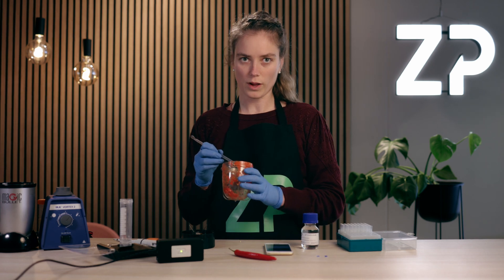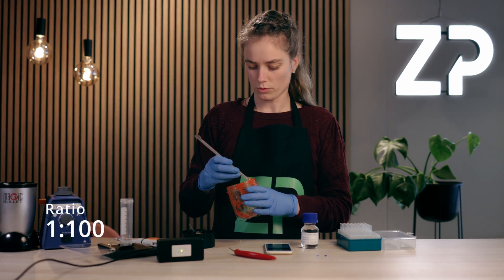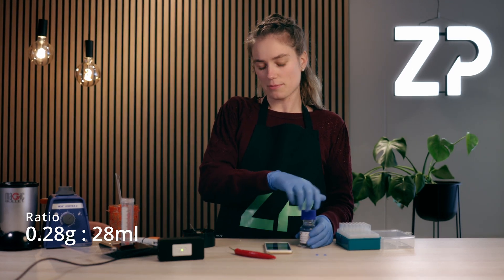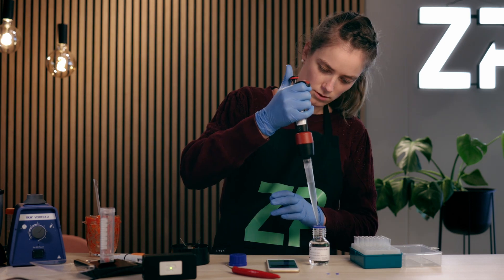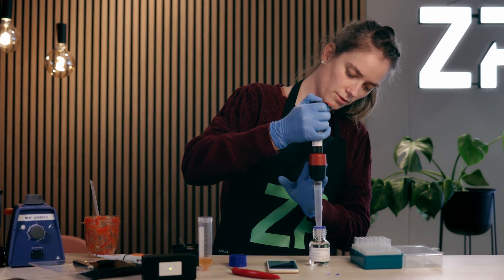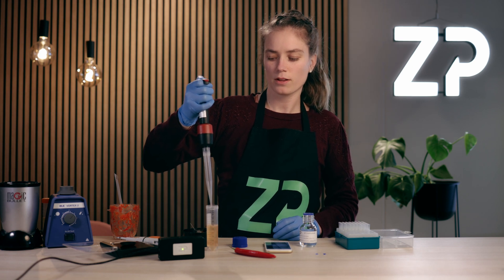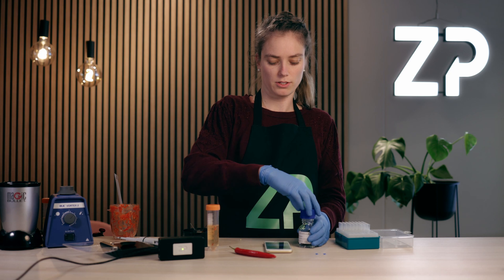I will weigh out a certain amount of the chilies and mix it with a buffer, and I would like to obtain a 1 to 100 ratio. I'll add a little bit more — so right now we have 0.28 grams, which means I will add 28 milliliters of the chili pot buffer. 28 milliliters and 0.28 grams gives a mixture ratio of 1 to 100, which is the mixture ratio we want for this chili.